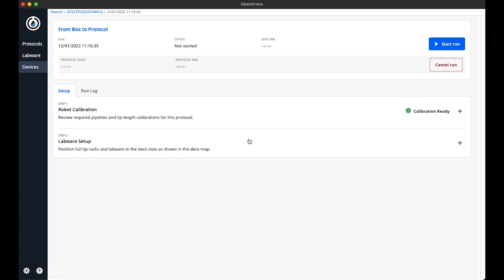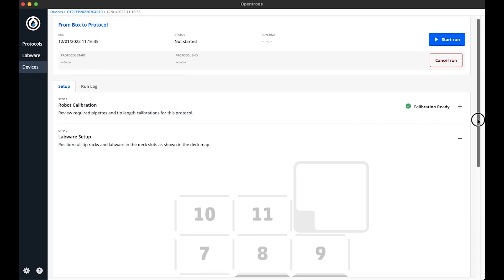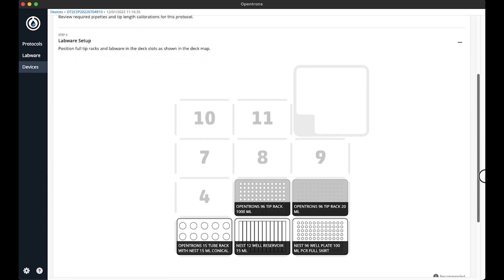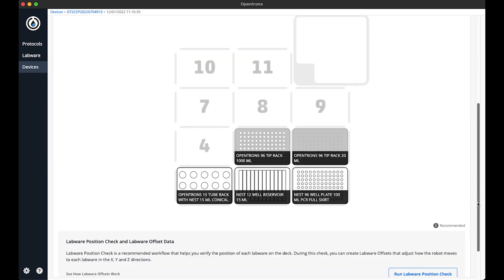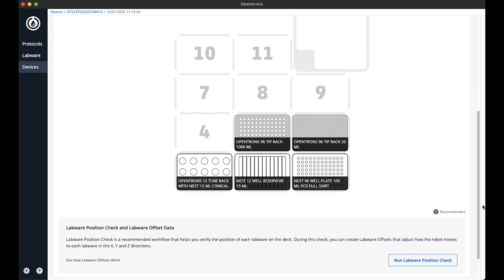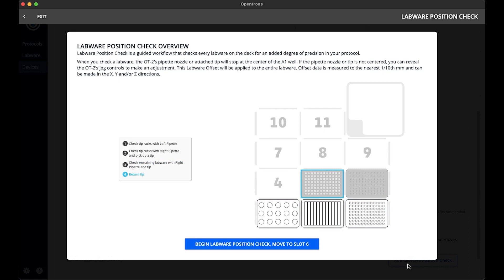I need to briefly talk about step two, labware setup. Opentrons recommends performing this labware setup as part of the setup of a protocol. This step mostly deals with applying or creating labware offsets using labware position check. These offsets are small adjustments for a pipette to go to the correct place on a specific labware in a specific deck slot. Since I have not performed the labware position check before on any labware, I can continue on with step two. This brings me to a nice explanation of what labware position check is and how to perform it.